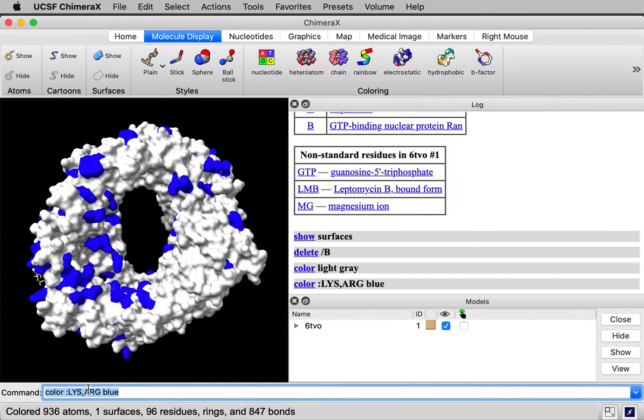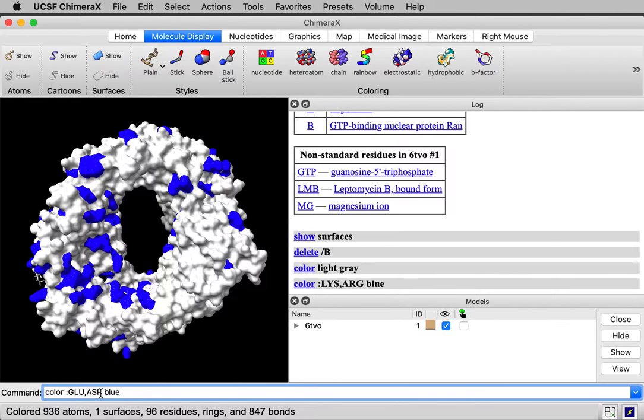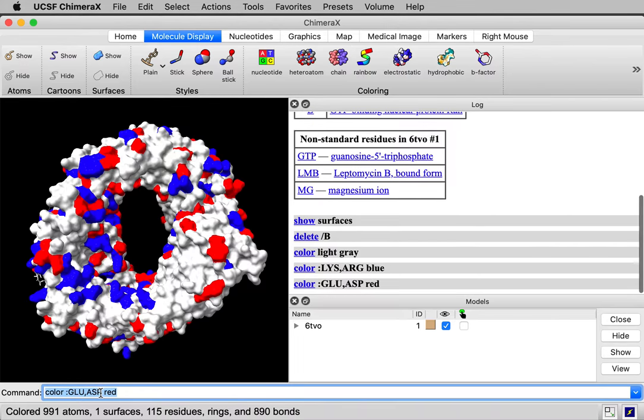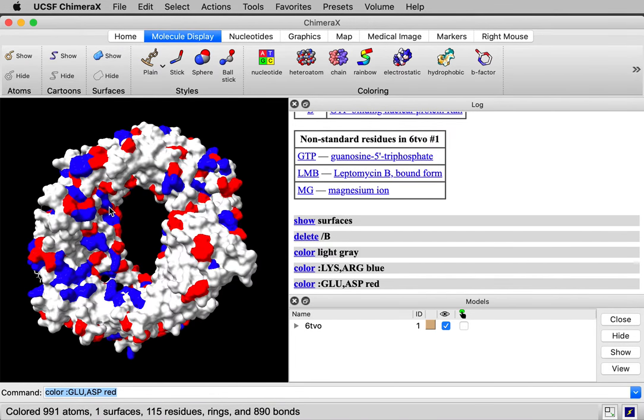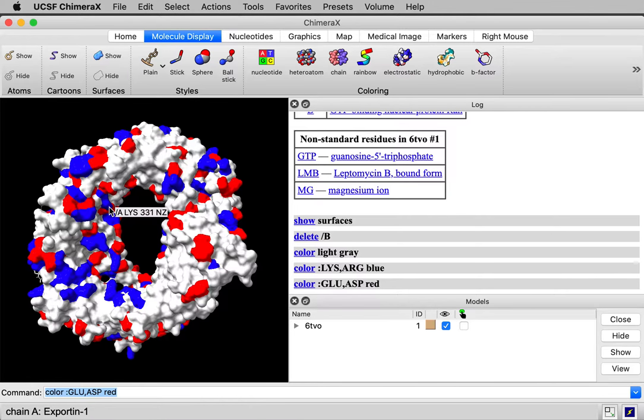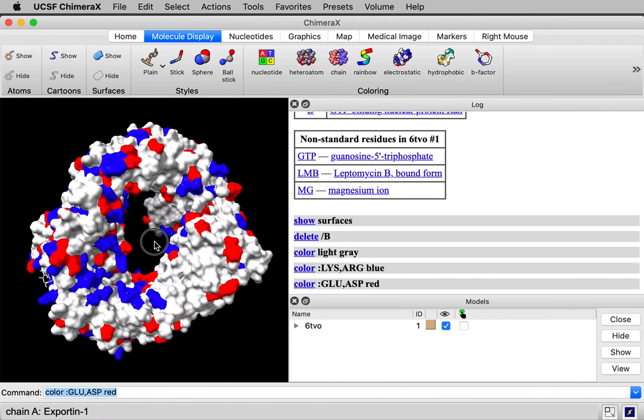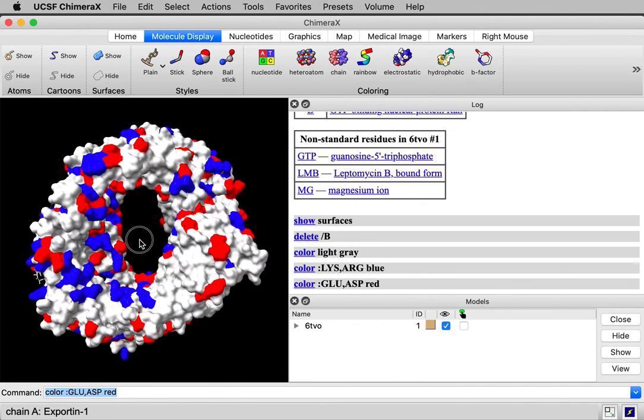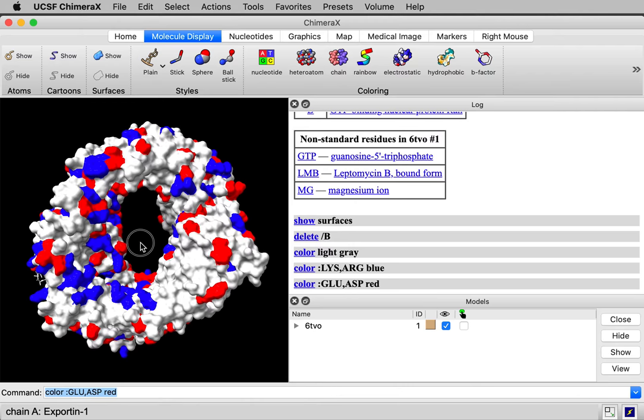And color the negative residues. Those would be at neutral pH glutamic acid and aspartic acid. We'll color those red. So this is coloring by charge. Charge is different from electrostatic potential. The potential is a measure of energy, how much energy it takes to move a charge nearby. But this is directly visualizing the charge and it gives a similar appearance.